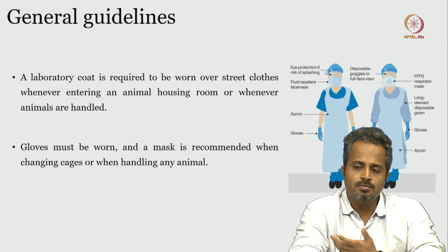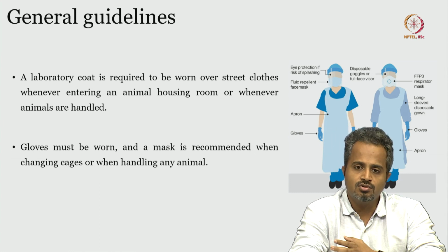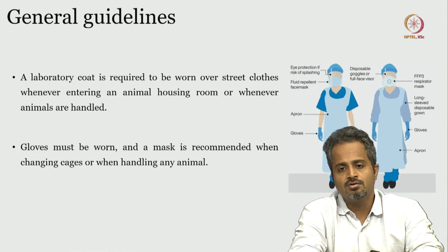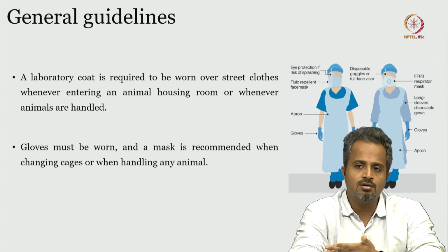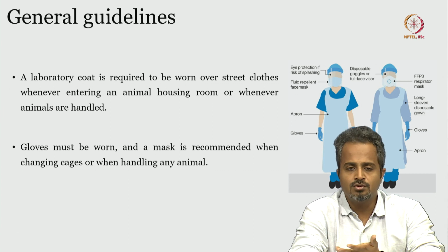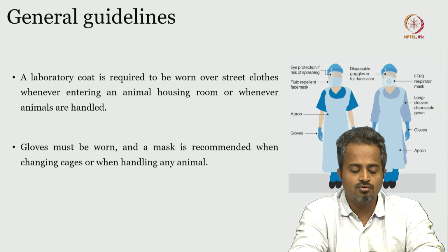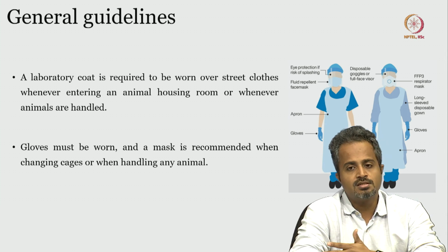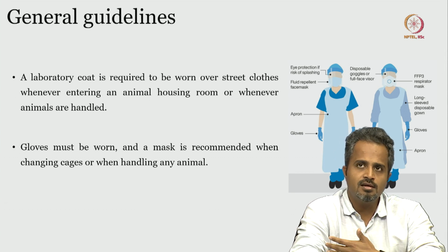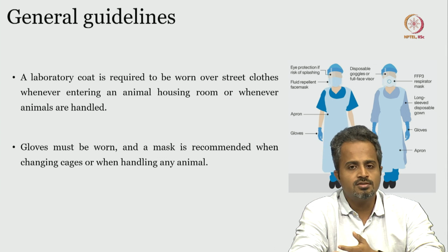So there is a possibility that the animal hair itself is enough to stick to your regular street clothes, and then you carry it over into your dining areas or even your living areas. Those can harbor organisms and then transmit the disease which the rodent was having. So naturally the lab coat is of utmost importance. If you're not really doing a surgery, if you're just handling, then a lab coat is enough.